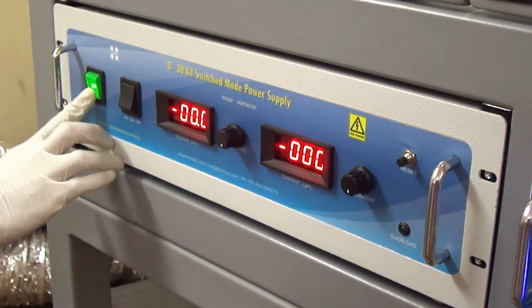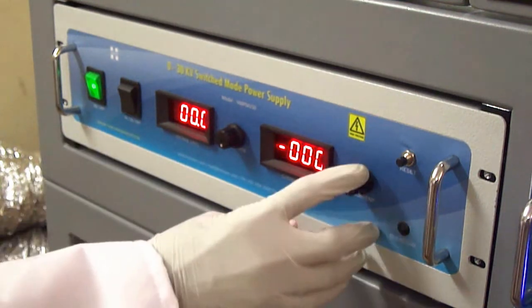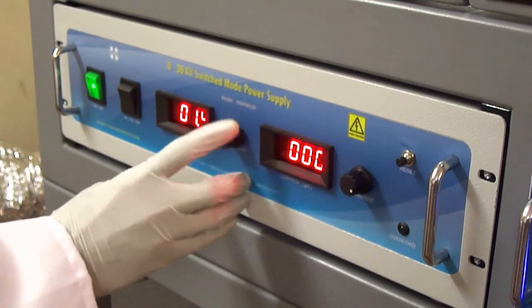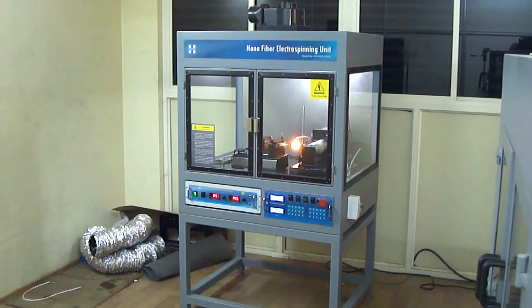The high voltage power supply delivers 0 to 30 kV output voltage range, with a maximum current capacity of 0.5 milliampere. The unit also features a built-in arc protection circuit.